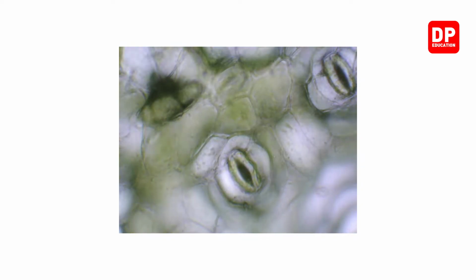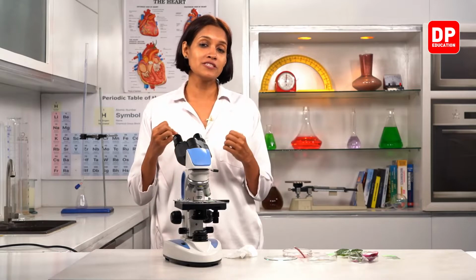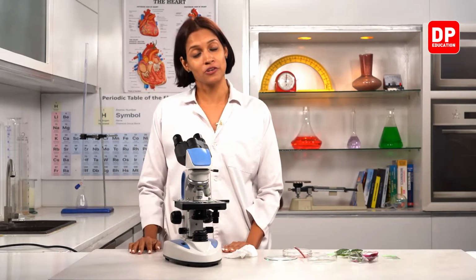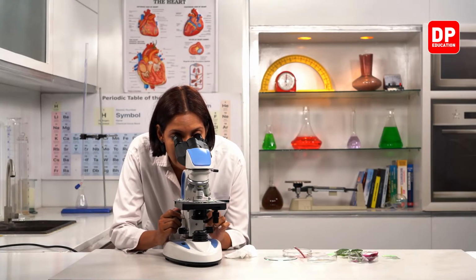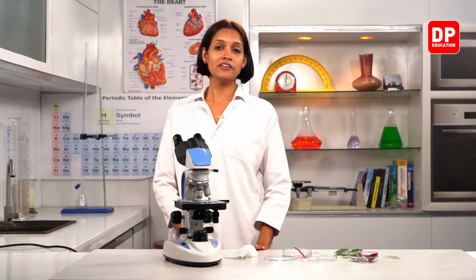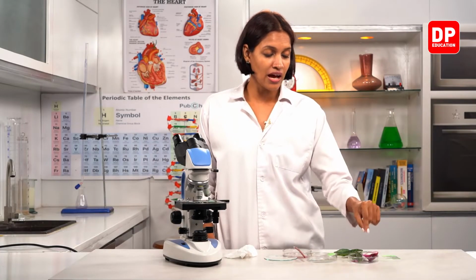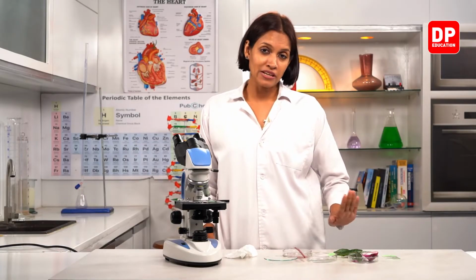Those are stomata. You all know that stomata of the plant leaves let oxygen go out and carbon dioxide enter the plants. Okay, children? So you all can see the stomata here very clearly. Right, children? So you observed 3 different types of plant tissues: onion peel, betel leaf and the royal leaf epidermal tissues.